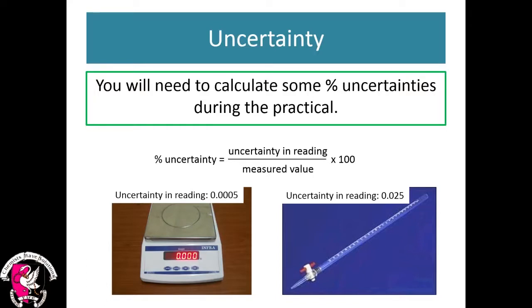If you do multiple readings, like in that table, you'll see that you're taking the mass of the thing as a whole, then removing your sample and weighing the filter paper or whatever it is again. That's two separate readings, so you add those two uncertainties together because you have two separate measurements.